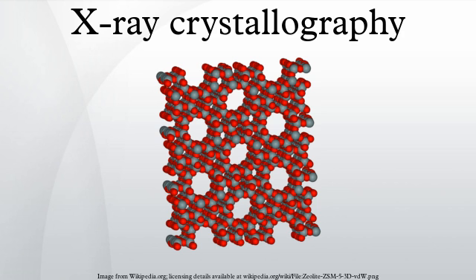For single crystals of sufficient purity and regularity, X-ray diffraction data can determine the mean chemical bond lengths and angles to within a few thousandths of an angstrom and to within a few tenths of a degree, respectively. The atoms in a crystal are not static, but oscillate about their mean positions, usually by less than a few tenths of an angstrom. X-ray crystallography allows measuring the size of these oscillations. Procedure. The technique of single crystal X-ray crystallography has three basic steps.